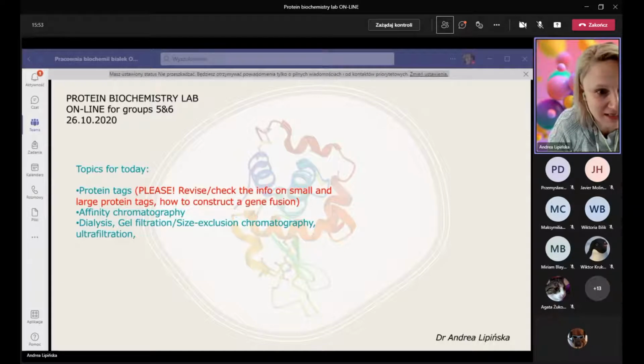So it is usually chemically bound to a carrier protein, or it can be used as a fusion, for example, with GST. GST has very nice antigenic properties. It's also good for chemical linking because it has lots of lysine residues, and lysines can be used for chemical linking, for example, with polyethylene glycol, so PEG. And then GST can also be used as a carrier. So immunization, increasing antigenic properties. This is, let's say, the last main reason why we tag proteins.